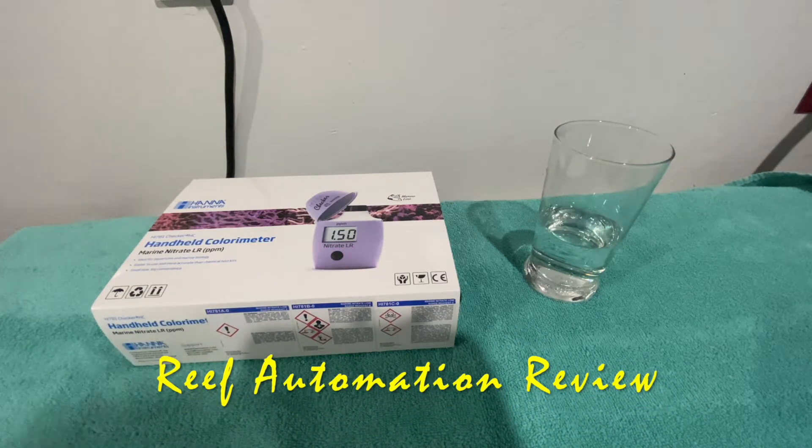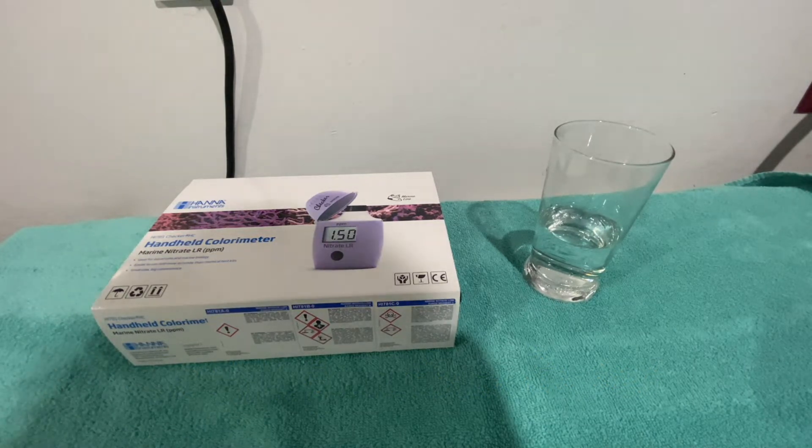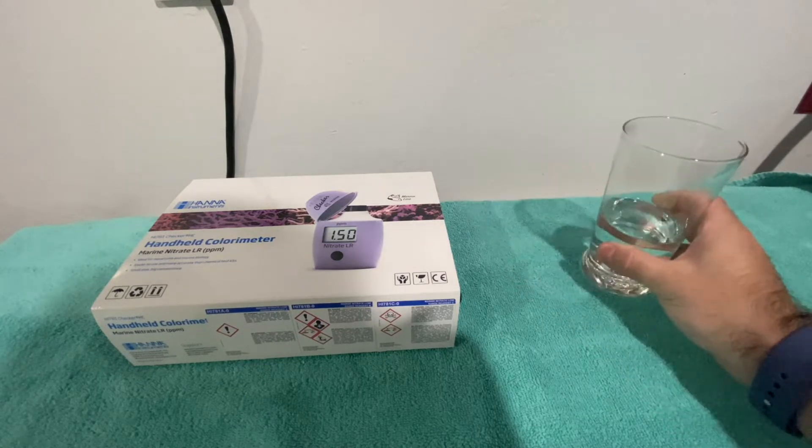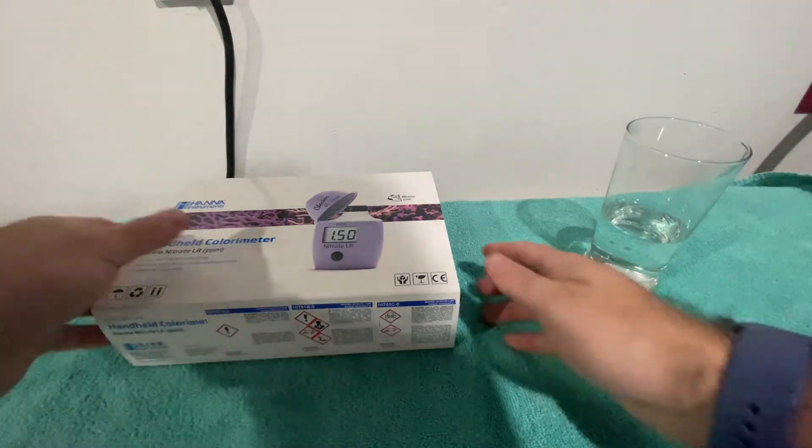Hello everyone, this is Derek with Reef Automation. Today I'm going to go over the new Hanna nitrate checker. I have some tank water here and I have yet to open up the unit, so let's get started.